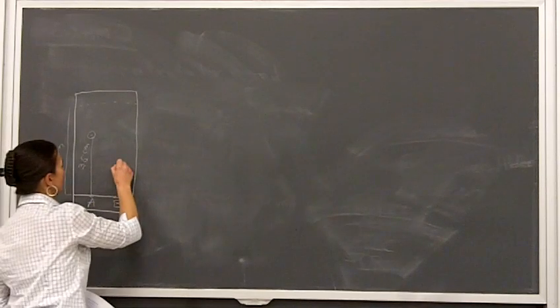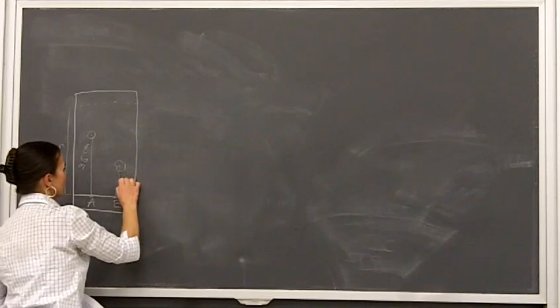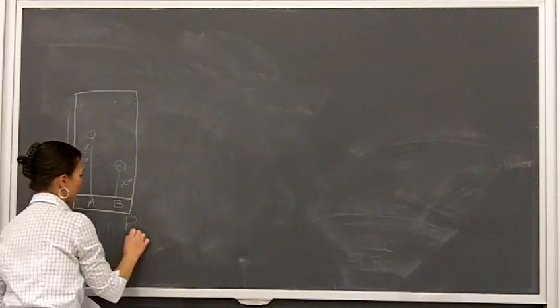So similarly, if B is here and it's 2 centimeters, what would be the RF value for B?